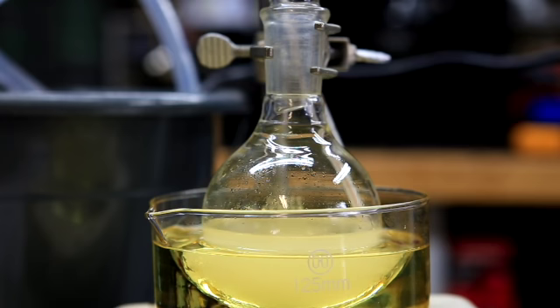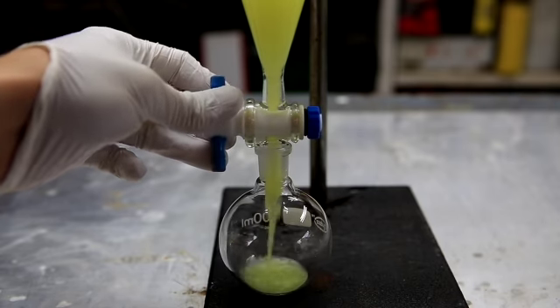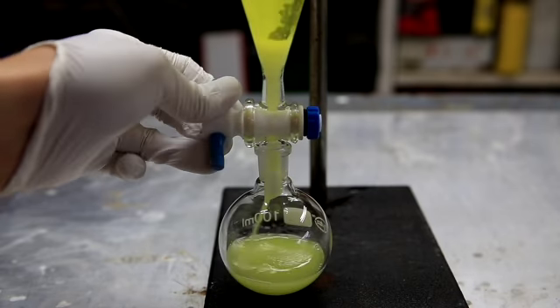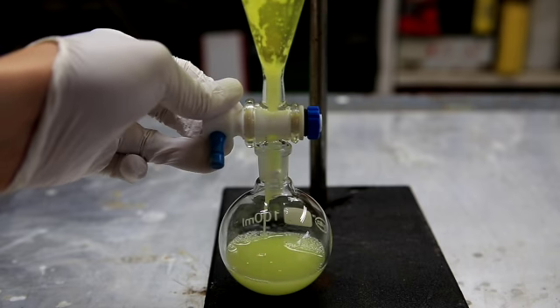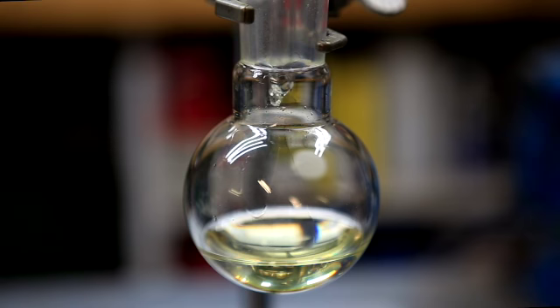A major use of nitrobenzene is for the production of aniline, and this is what I'm going to be using it for. In this video, we'll be synthesizing nitrobenzene, but it's very important for me to point out that nitrobenzene is extremely toxic and it must be handled with care. So with that being said, now we'll jump into the synthesis.